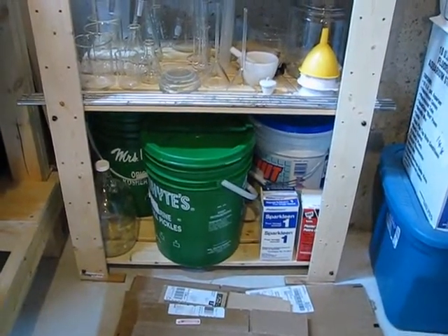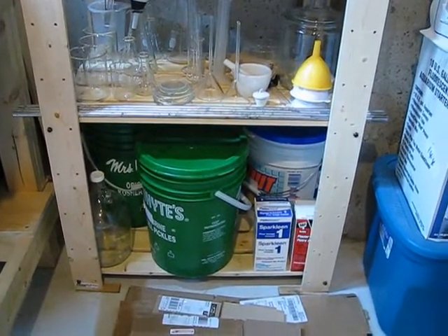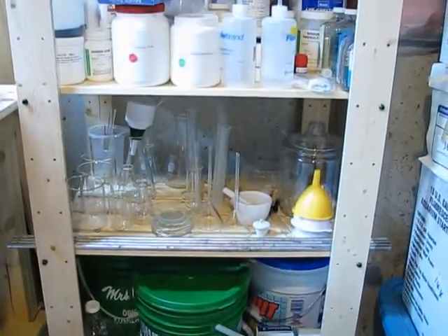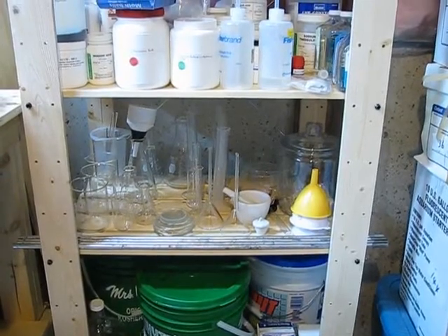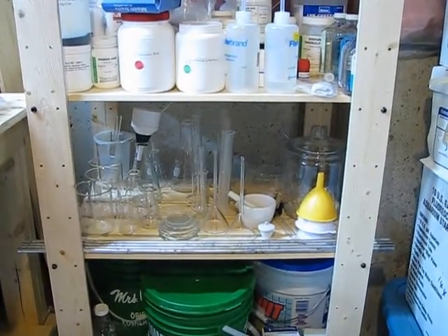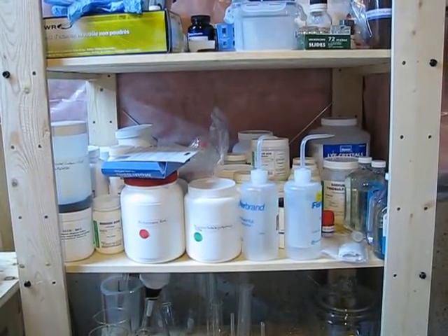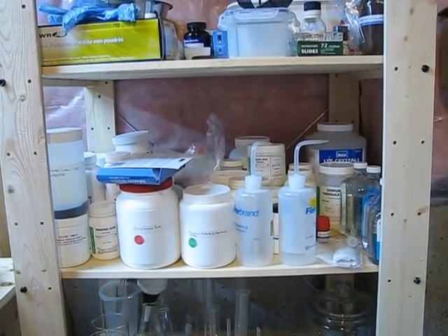I've got secondary containment for flammable solvents, acids and bases, as well as some other things like glassware cleaning detergent. Up one level we have the boring glassware — beakers, flasks, graduated cylinders, desiccator, watch glasses, the list goes on. Up here we have innocuous chemicals, mostly salts, a couple liquids like mineral oil for heating baths, and some organics.